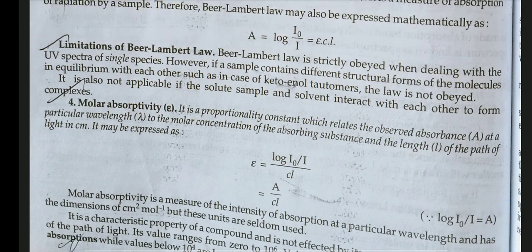Beer-Lambert law is strictly obeyed when dealing with the UV spectra of single species. However, if a sample contains different structural forms of the molecules in equilibrium with each other, such as in the case of keto-enol tautomers, the law is not obeyed. It is also not applicable if the solute and solvent interact with each other to form a complex.